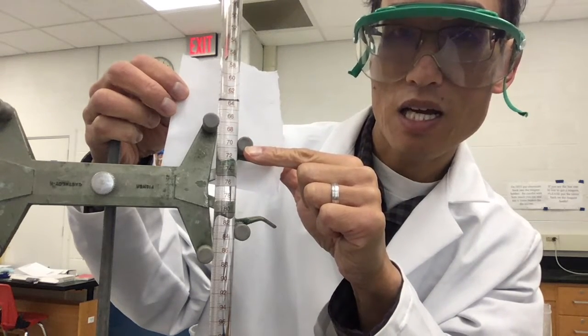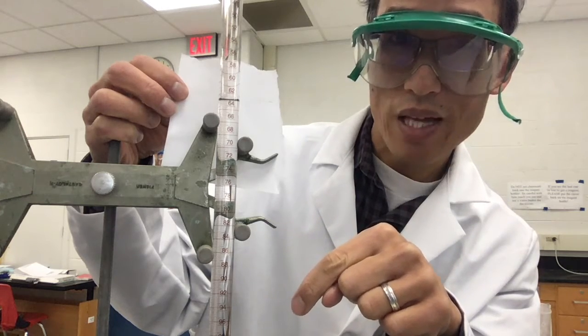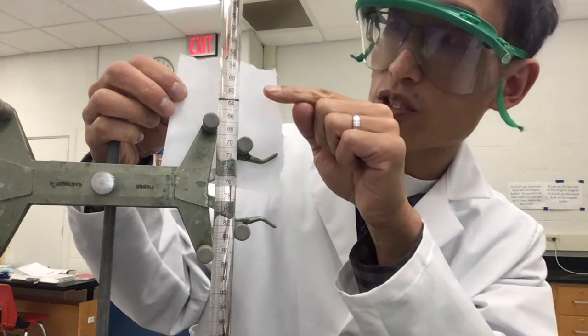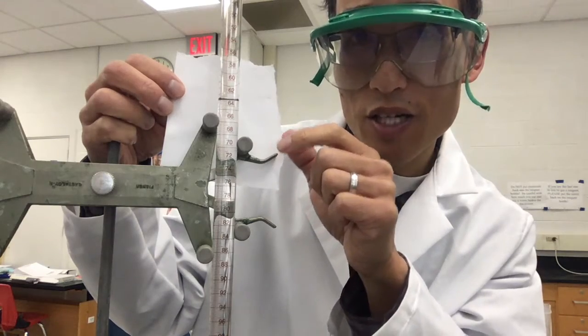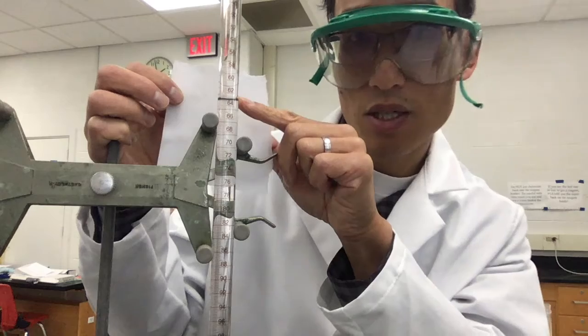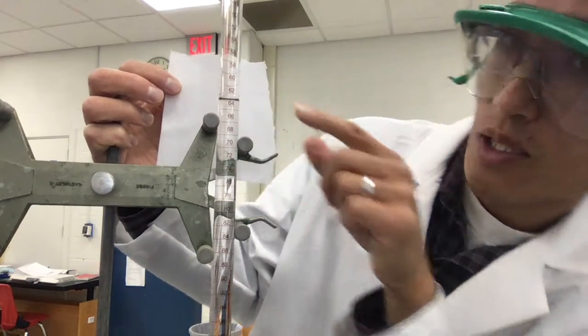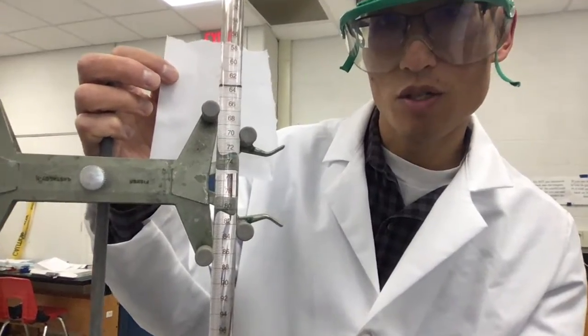They read from 0 at the top to 100 at the bottom. So when you're looking at this, this line here is 62. Then as I go down, these are 0.2 milliliter graduations.